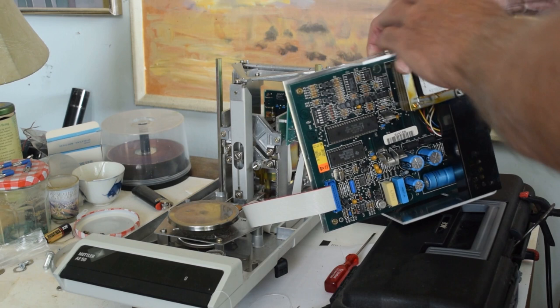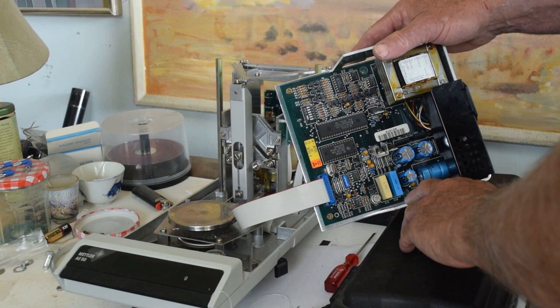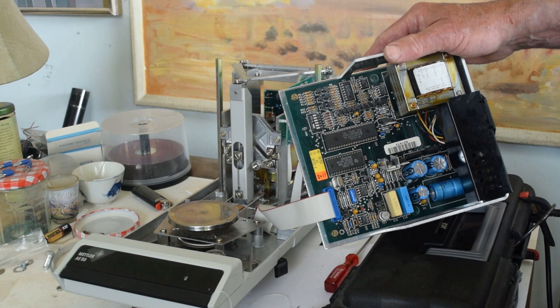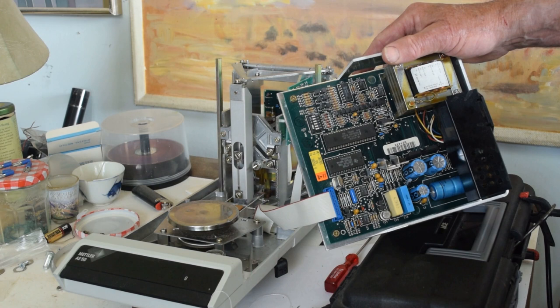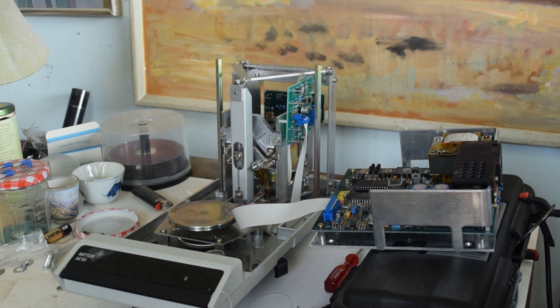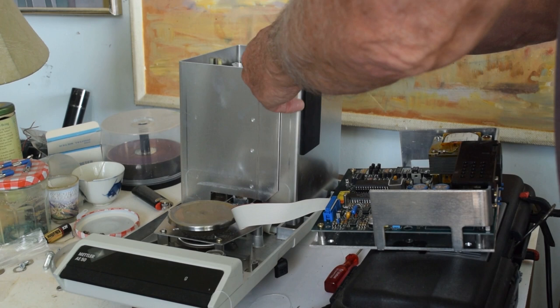I measured the voltage coming off the analog board and found it seemed to be able to measure up to probably 200 grams. So I thought, well, this is interesting. I noticed these DIP switches — Mettler doesn't give any documentation for them at all — but I just flipped each one in turn. When I got to switch six and flipped it up, the whole behavior of the balance changed, and now it will weigh quite readily to its maximum specification. I haven't tried to go through the calibration routine since I flipped that switch.